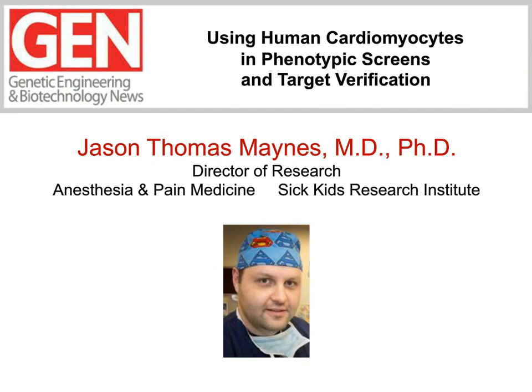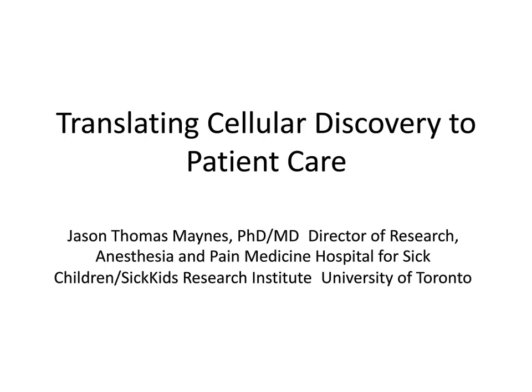I'm going to focus a little bit different in my talk. I'm going to look at how we can use iPS cardiomyocytes to better model human disease and therefore provide more intelligent therapies to patients going forward.